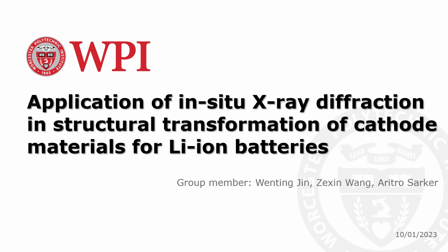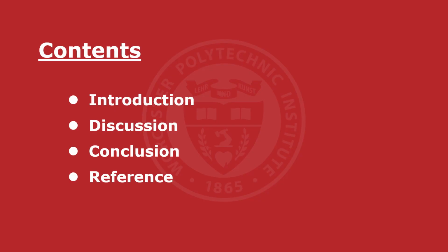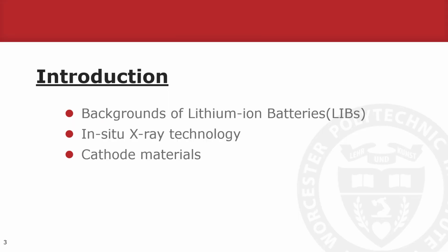Hi everyone, today we are going to talk about the application of in-situ X-ray diffraction in structural transformation of cathode materials for lithium-ion batteries. We'll introduce this to you in 3 parts. Let's start from introduction. First, we'll talk about some basic knowledge of lithium-ion batteries, and next we'll talk about in-situ X-ray technology. Finally, we'll give a brief introduction of the cathode materials that we'll use as an example in the following sections.